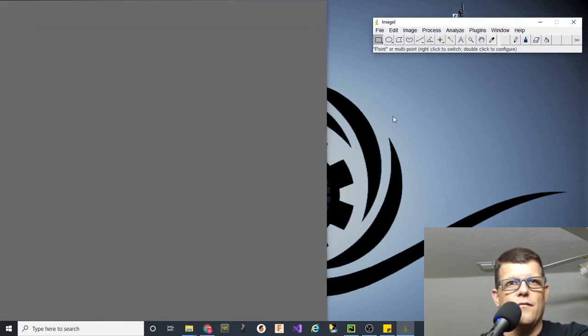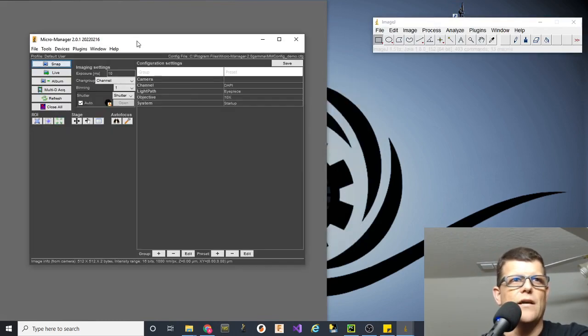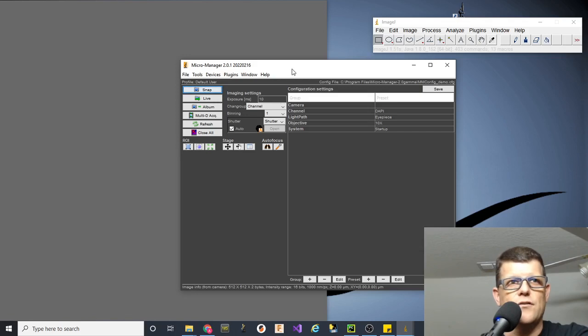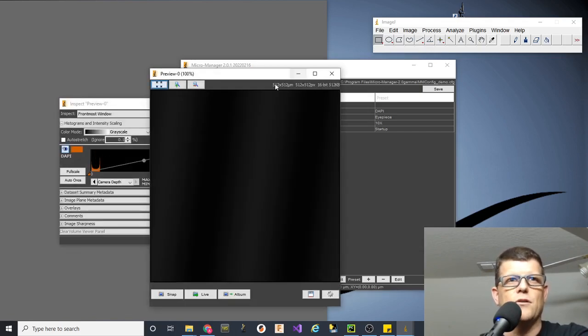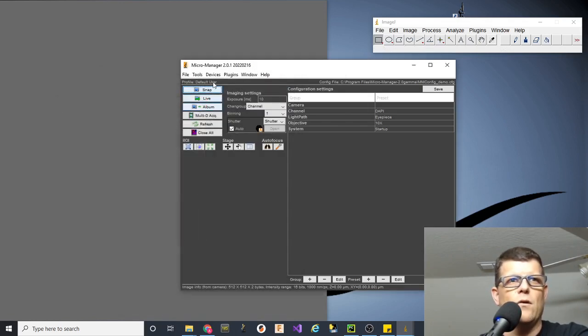I'm going to use a demo configuration. So this has just vanilla, what you get off MicroManager if you download it fresh from the internet. All of these are demo devices. Snapping images produces a fake image, stuff like that. So that's cool. That's what I want.